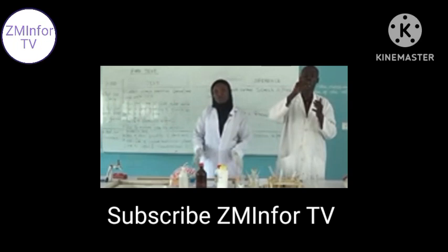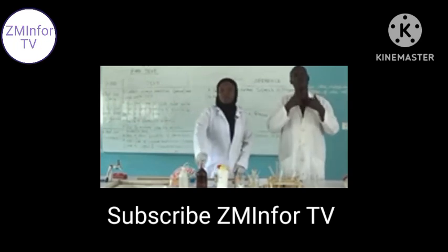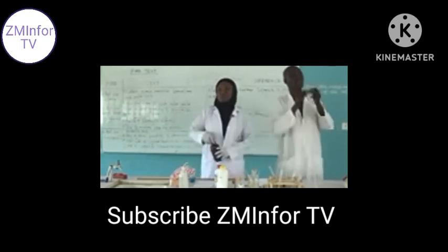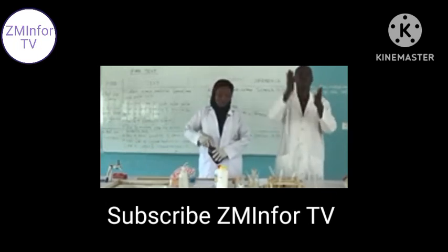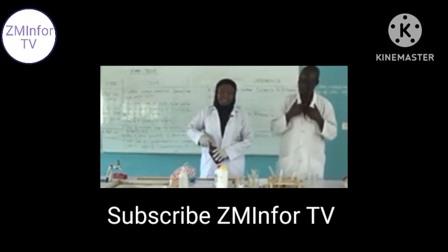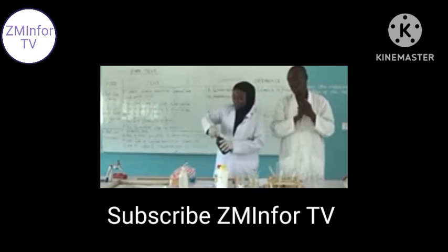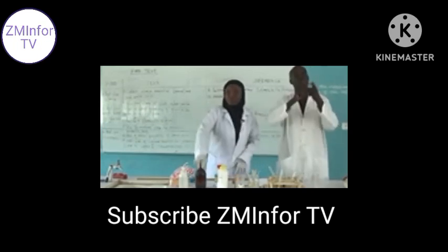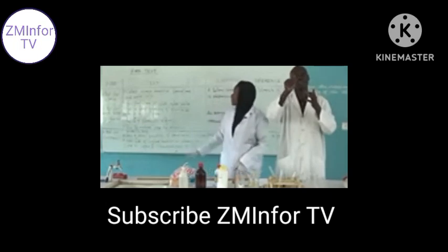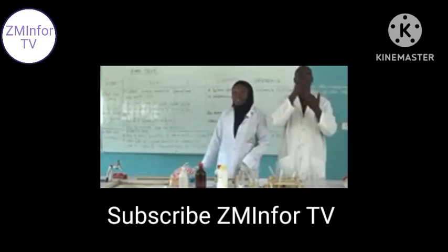We have gone through certain food substances in our houses, common ones, which show that these materials are present. We have run a simple test using starch material, bread, to see the presence of starch. We have tested for simple sugar in glucose.